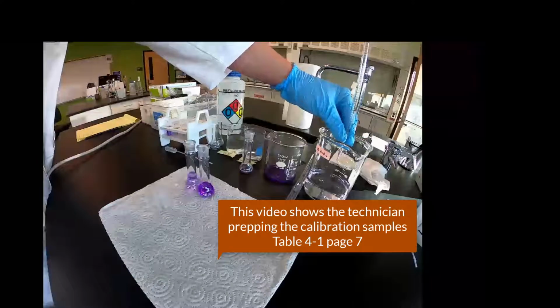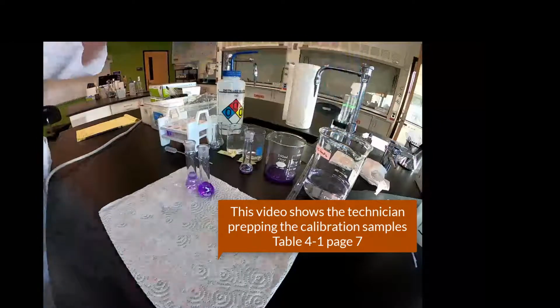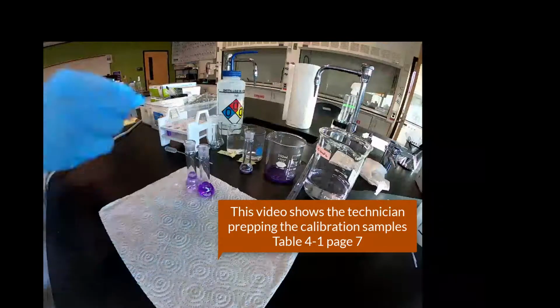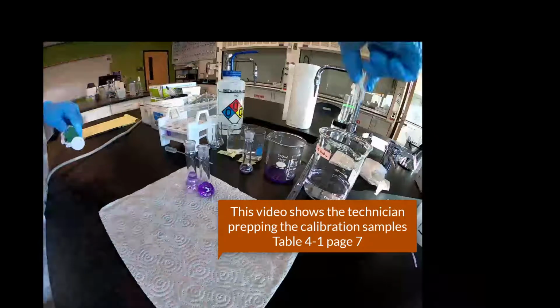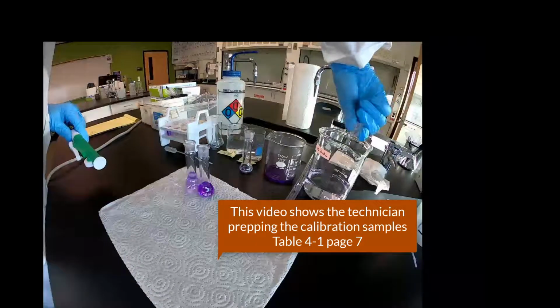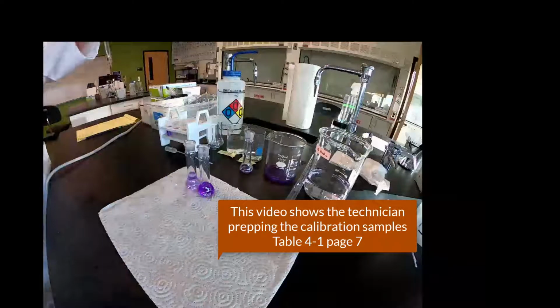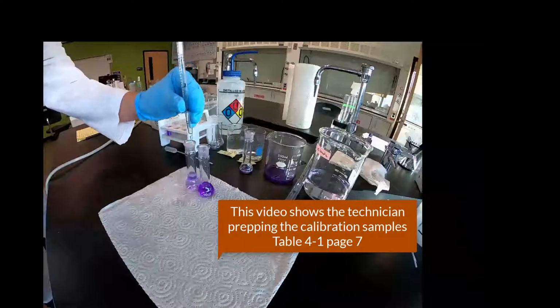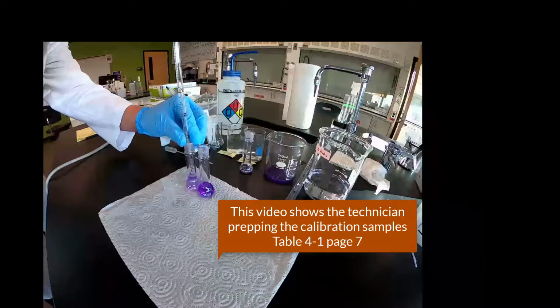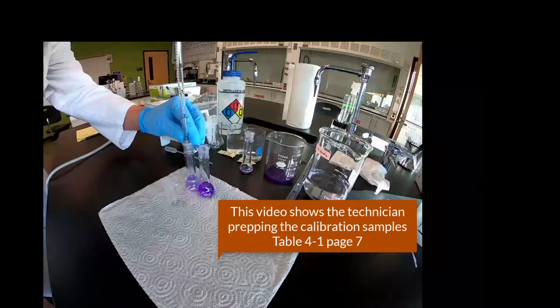Okay, decided maybe I better rinse that pipette out. While I'm at it, might as well rinse that out too. Okay, good. So we got the rinse in. That's very good. So now we'll put sample in there. This is sample number 3, 1 ml diluted to the mark, the 10 ml mark with water. Good stuff.